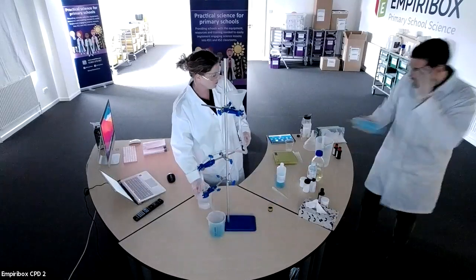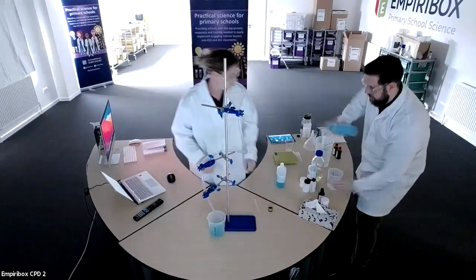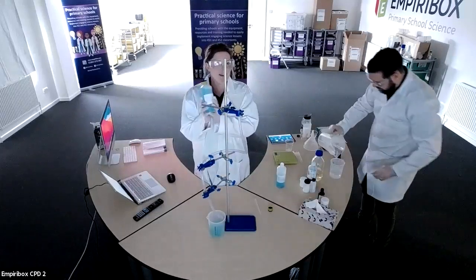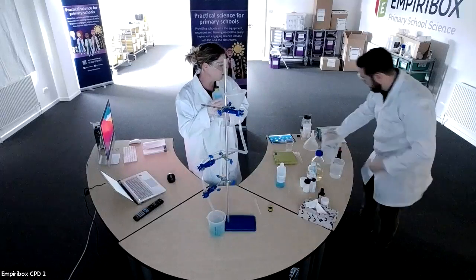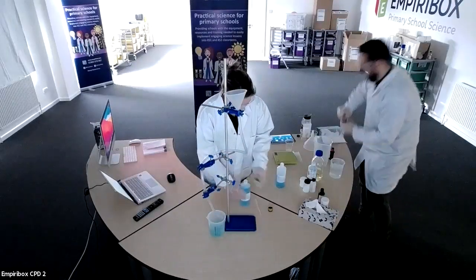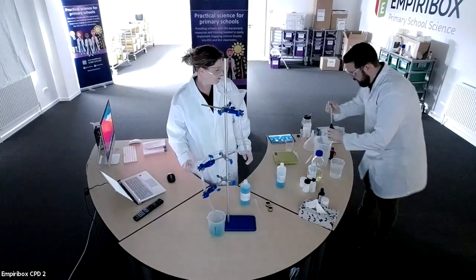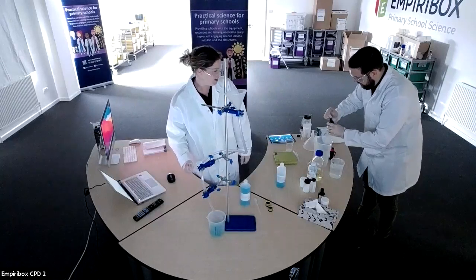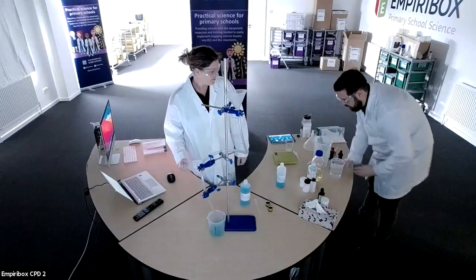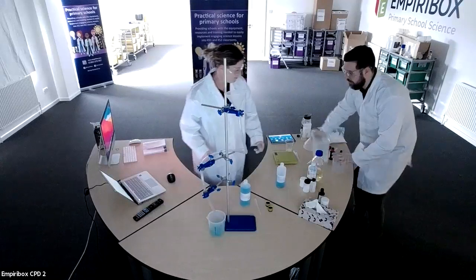Yeah, it's no problem. I'm just going to give you new water. Okay, so that's my first chemical ready. So this is my chemiluminescence, all mixed and good to go. So we're just mixing our water with the hydrogen peroxide here. And then I'm just going to pour it. Just a good bit of mix. Okay. Let's see if that now works.